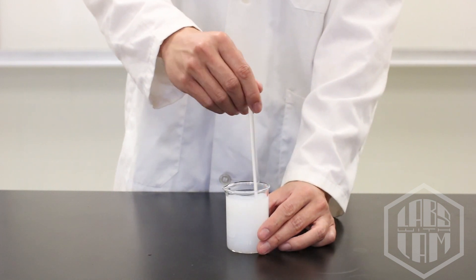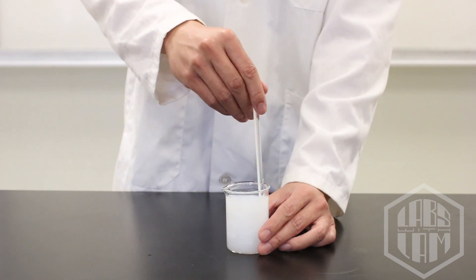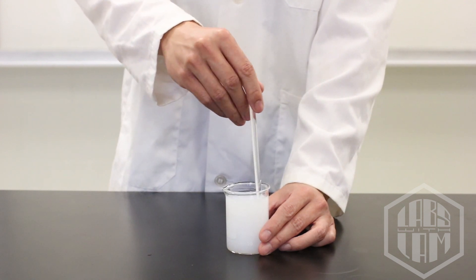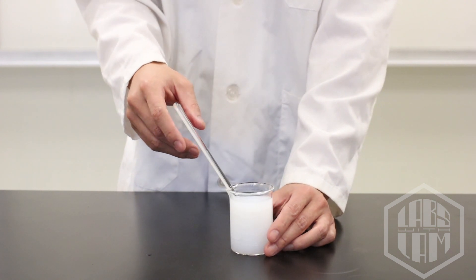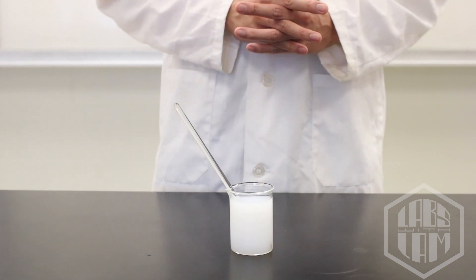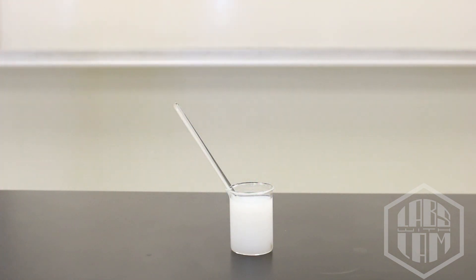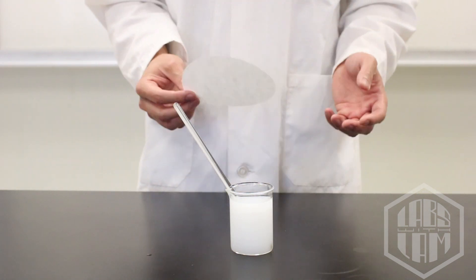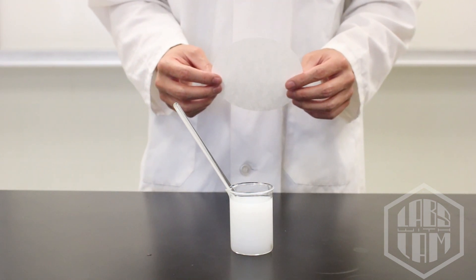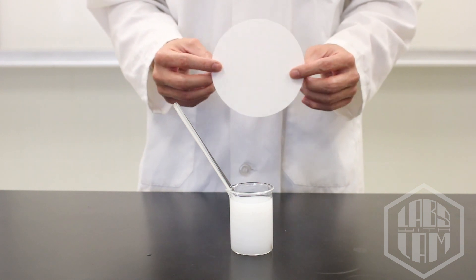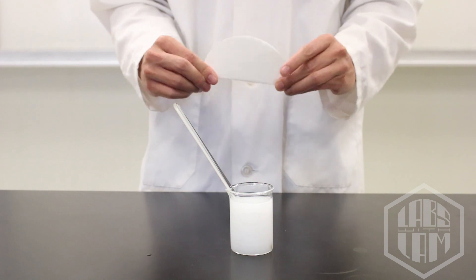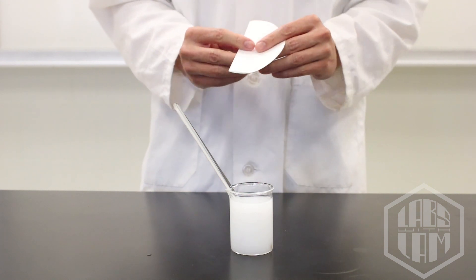I'll give this a quick stir, and while we wait for the reaction to complete, let me go grab some filter paper and I'm going to show you what we're going to do with it. Alright, this is pretty simple. We're just going to fold it in half and then fold it in half again. So quarters.